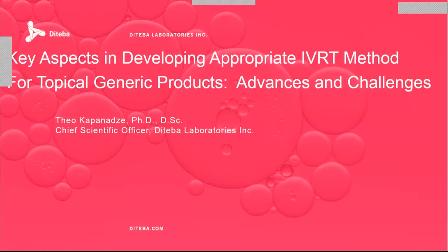I want to welcome everyone to my presentation, in which I will focus on the in vitro test methodology, which is IVRT, that is using artificial synthetic membranes instead of biological or ex vivo human skin. IVRT is used to monitor release diffusion of drug substances from semi-solid dosage forms, and as a tool to support product development has been around for approximately 50 years. Therefore, it's a relatively well-established methodology.